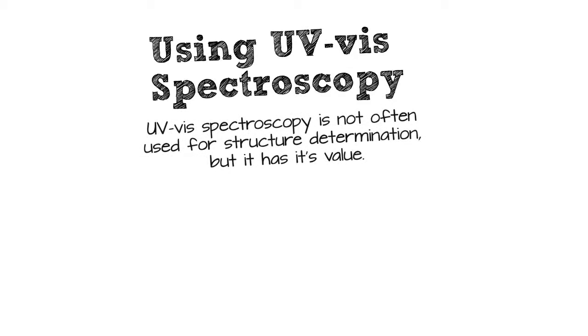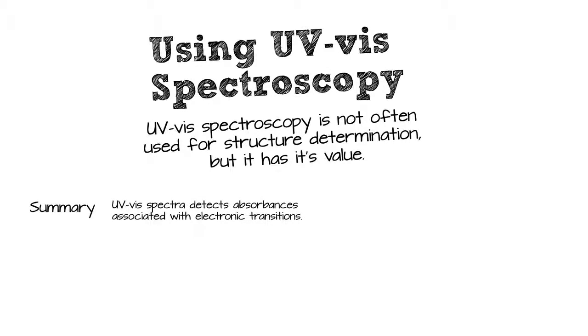In this presentation, we're going to explore some of the more practical uses of UV spectroscopy in a research lab that you might be working in. As you might have got the impression from my previous presentation, I made the case that UV spectroscopy is useful, but that for structural determination, we tend not to lean on it too much.